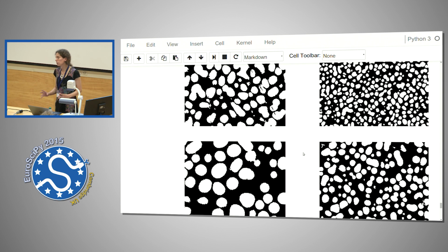So even if you have automated everything, so that you don't have any manual operations to do, it's always a good idea to take a look at the final result to be sure that your image processing pipeline didn't do any crazy things. So this is the end of this tutorial. I really wanted to insist on the fact that it's important to be able to process not only one image, but going from one image to a large collection of images is important as well.